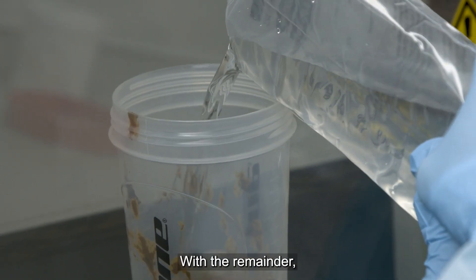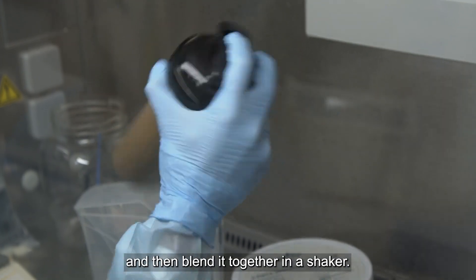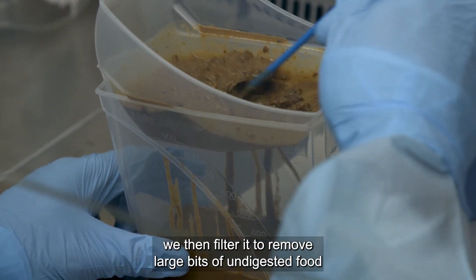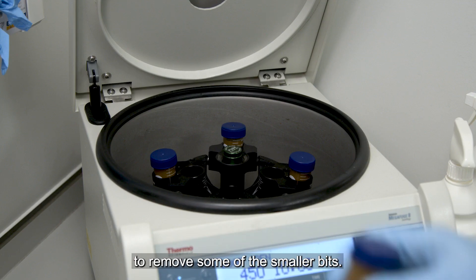With the remainder, we add this to salt water or saline to dilute it and then blend it together in a shaker. With this slurry we then filter it to remove large bits of undigested food, before then doing centrifugation to remove some of the smaller bits.